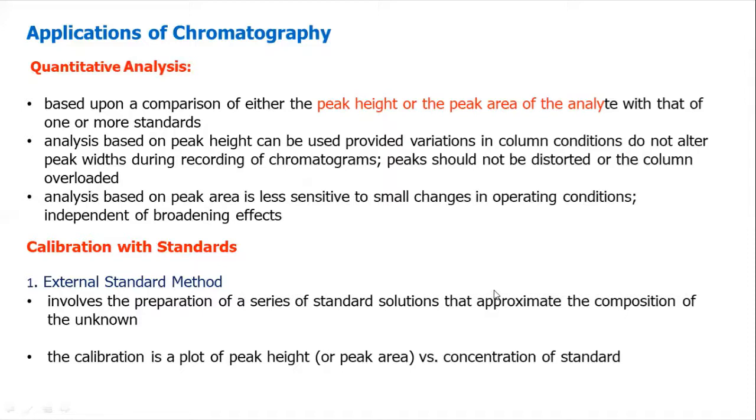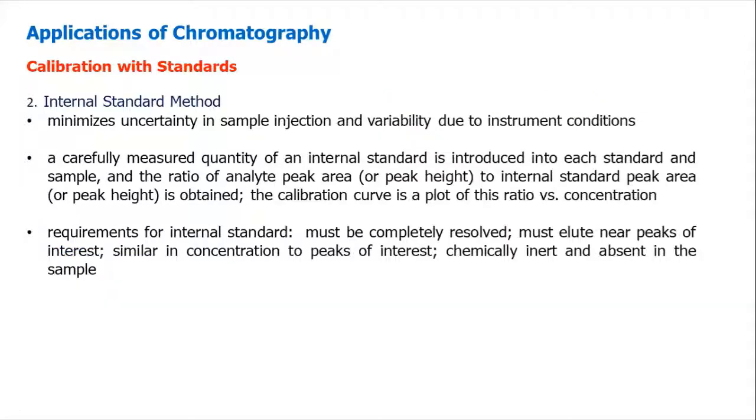For calibration with standards, first is the external standard method. It involves the preparation of a series of standard solutions that approximate the composition of the unknown. The calibration is a plot of peak height or peak area versus concentration of standard. So that is for external standard method.